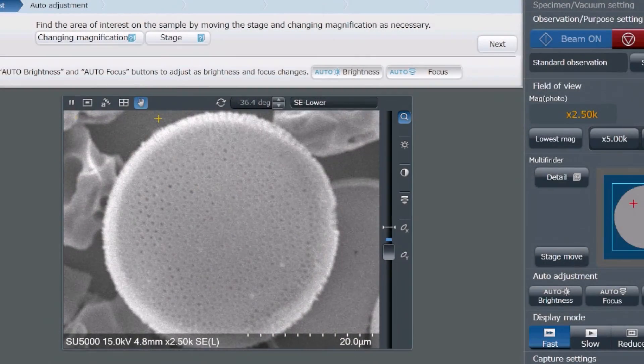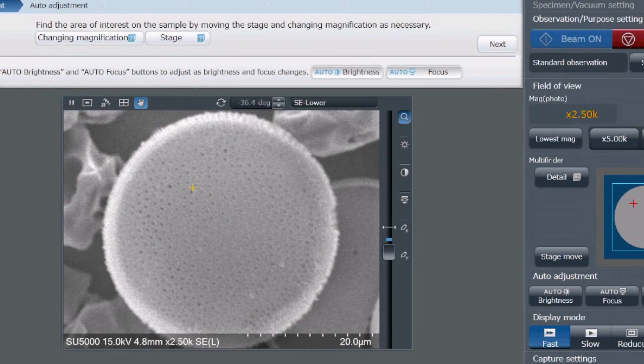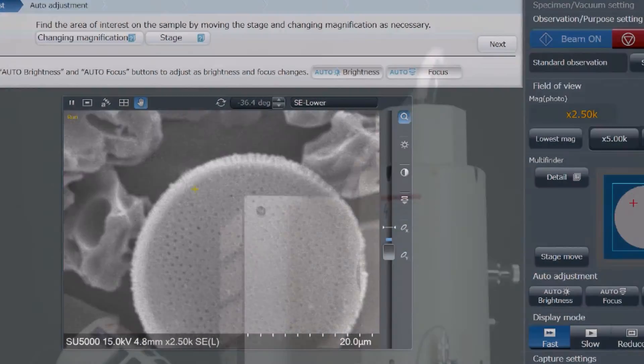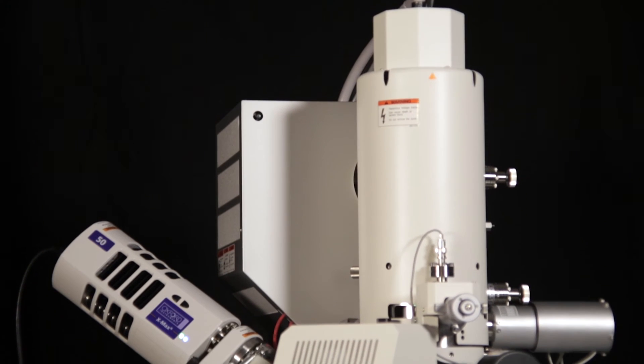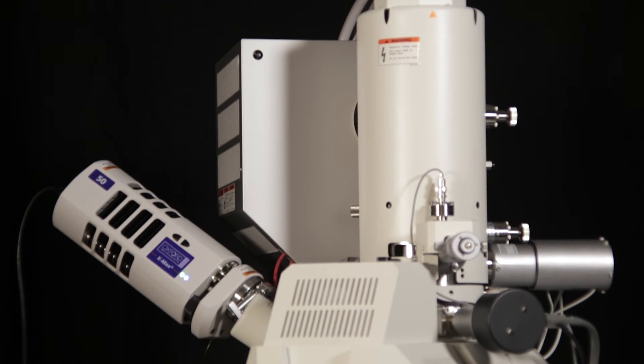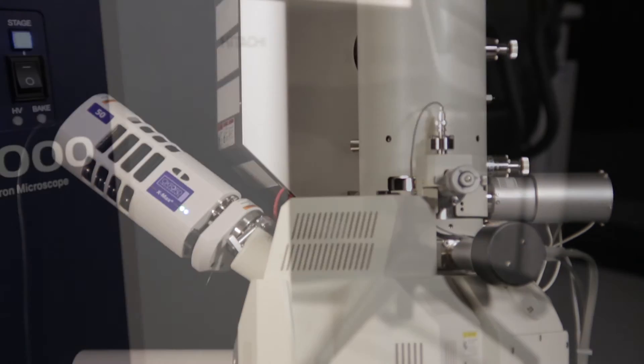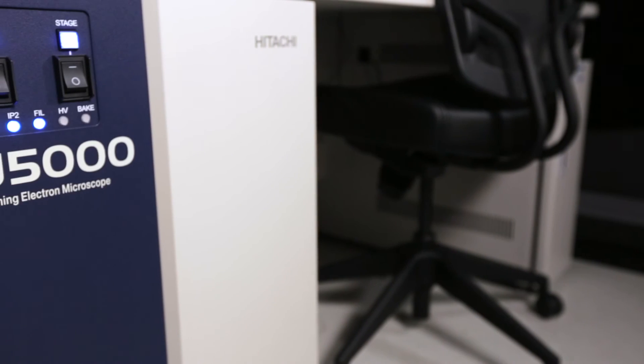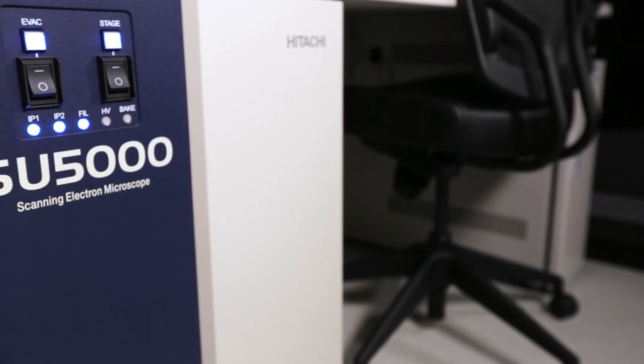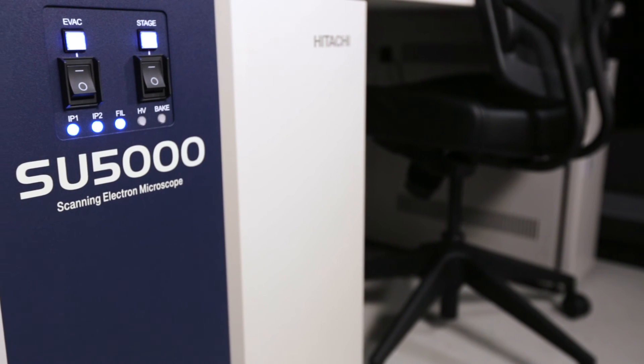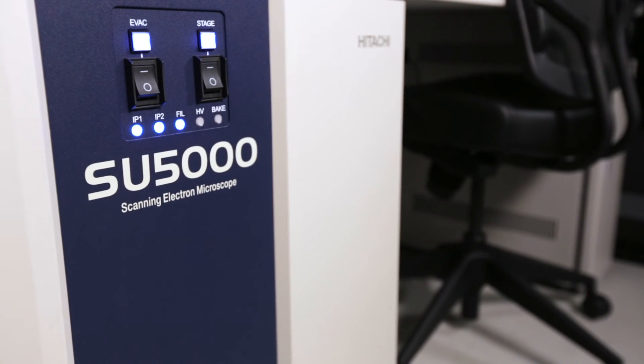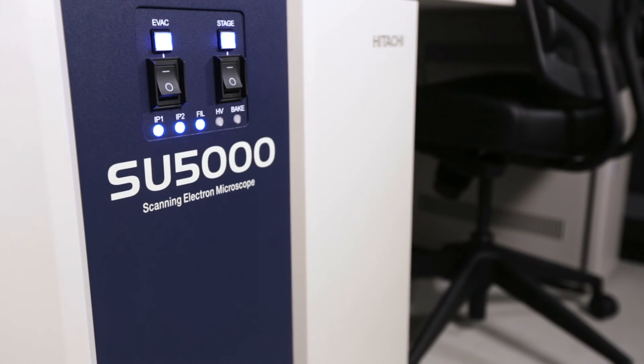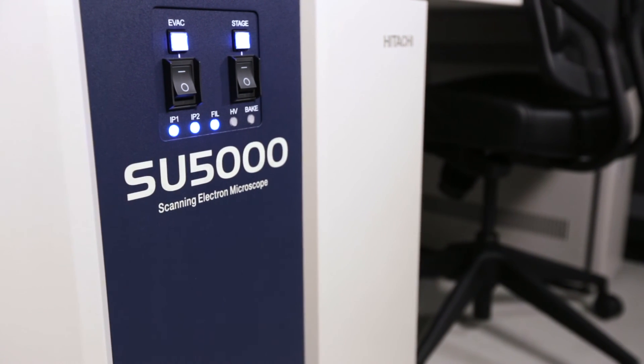Furthermore, Hitachi is world-renowned for a reputation for reliability and low cost of ownership. As always, Hitachi remains committed to customer support, service, and satisfaction. Exceed your research boundaries with the SU-5000.